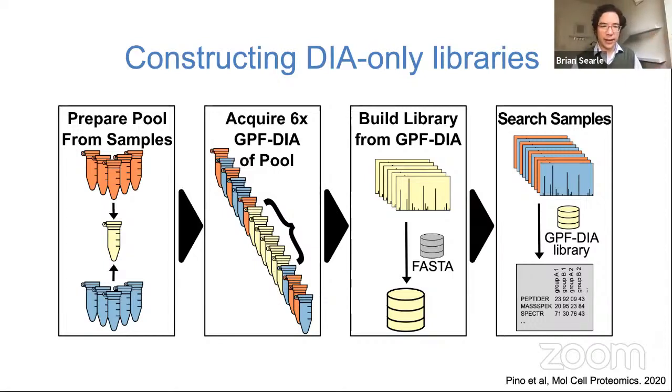So for example, I can say, well, I found this peptide that I'm interested in. I know exactly where it is in time and space, and I can go look it up with the right tools. We've tried to make this workflow very easy to use in Encyclopedia, but you can use this with other types of methods too. We've done it with Skyline, for example, before. Okay, great.